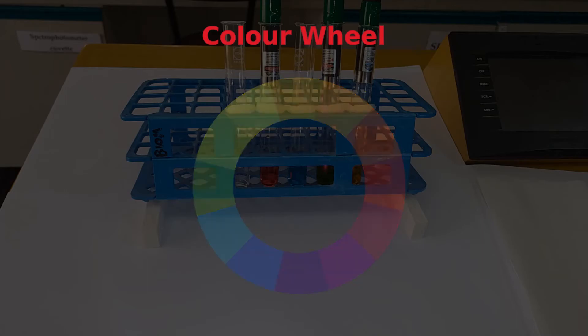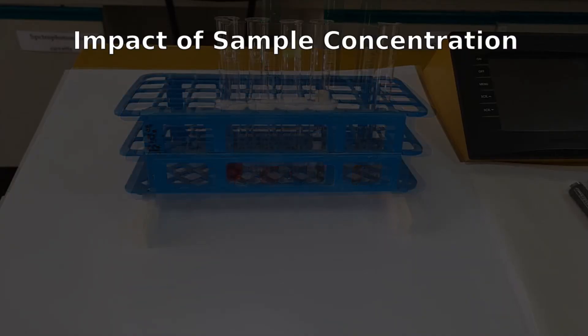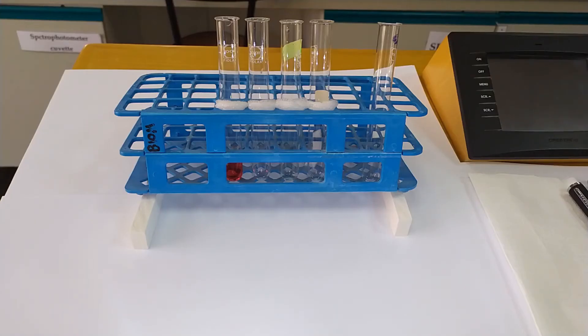In fact, many molecules are able to absorb specific wavelengths of light. And this is why we're able to use these wavelengths of light to try to detect and measure their concentration. Now, let's see how that works. Now that you've seen how light of a particular color or wavelength can be blocked by a particularly colored molecule, let's see how the concentration of a colored molecule affects the passage of light.